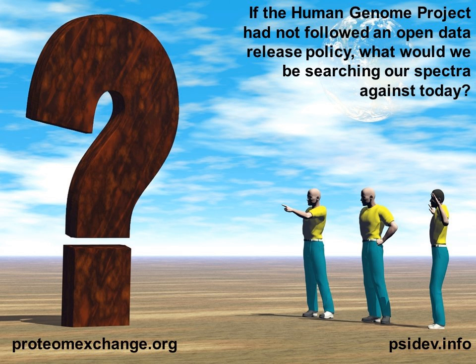Okay, so Kim: some of the metadata that source data repositories collect contain free text. Are you processing them further on the ProteomeXchange side to tease out key information in a more structured way to facilitate data search and integration? So no, we are not processing the data we get from the submitters.